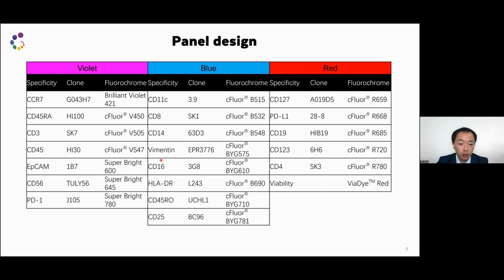You can see this marker I mentioned is an intermediate filament protein. Its role is mainly focused on intracellular structural property and contribution to enhanced malignancy of tumors by its involvement in epithelial to mesenchymal transition. In recent years, an extracellular role for it has been proposed, and in this study, we keep this marker to demonstrate its extracellular expression.